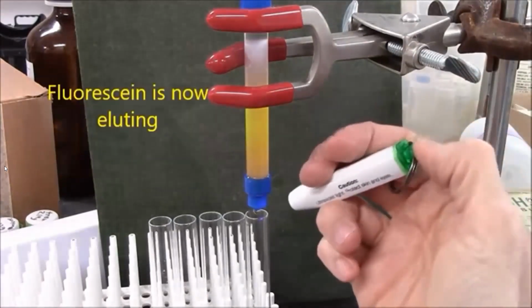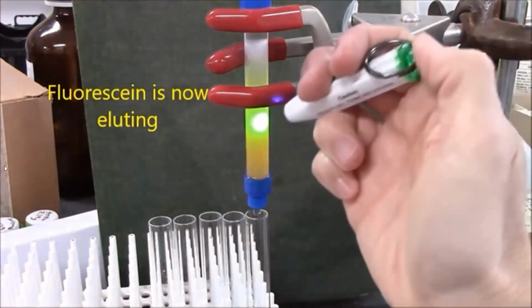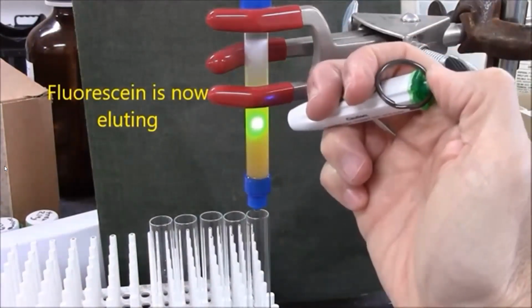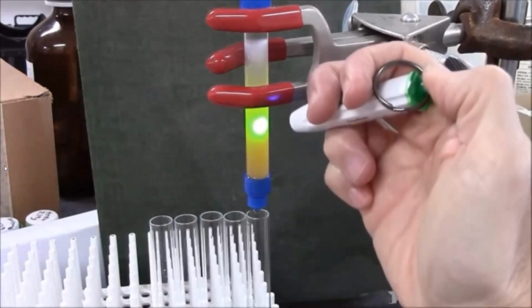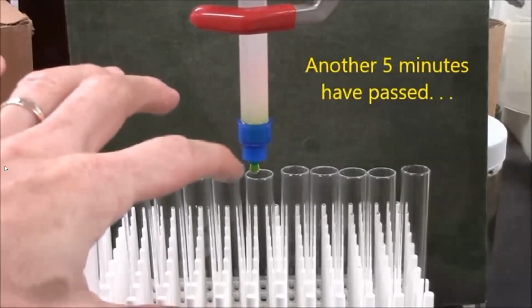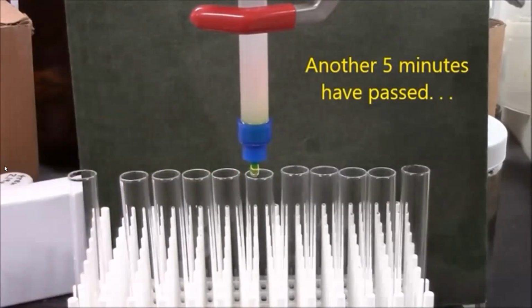The fluorescein is now eluting from the column. Fluorescein is fluorescent. I'm shining a little blue light, UV light on it, and you can see it glows green. The last little bits of fluorescein are emerging from the column now.